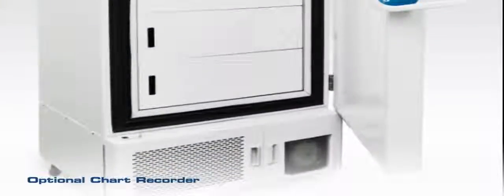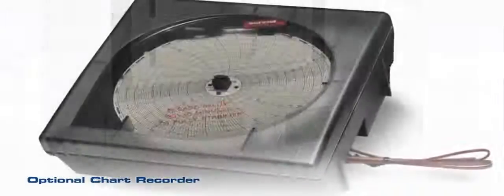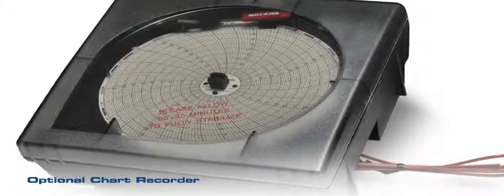Optional chart recorder is available for independent temperature monitoring, which is factory prepared for field installation.